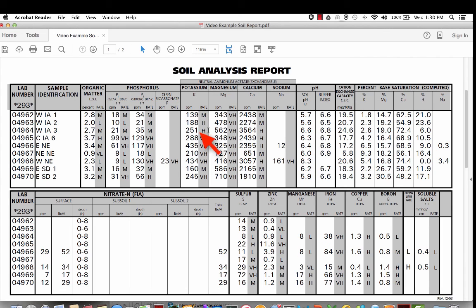On the third sample, the part per million is showing quite a bit of potassium there and probably wouldn't call for additional potassium to be applied. And the percent K is showing us that maybe we are a little under that percent base saturation that we'd like to be at. And the main reason for that is this is a heavier soil with nearly a 25 CEC.